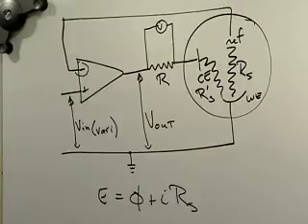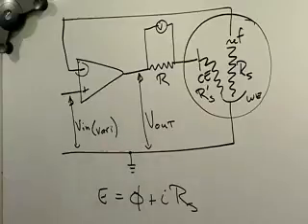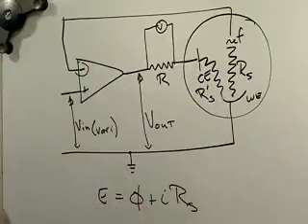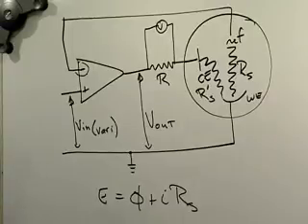We kind of count on the resistances that we've put into the circuit, and we know are there from the electrochemical cell, to avoid this situation. You have the same problem, say, in the thermostat, in the heater in your home. Any thermostat and negative feedback loop will do this, right? If you pop open your thermostat, you'll find there's always a resistor in there. Because if it wasn't there, the house temperature would get up to exactly what you set it, and that would tell the thermostat to tell the furnace to turn off.